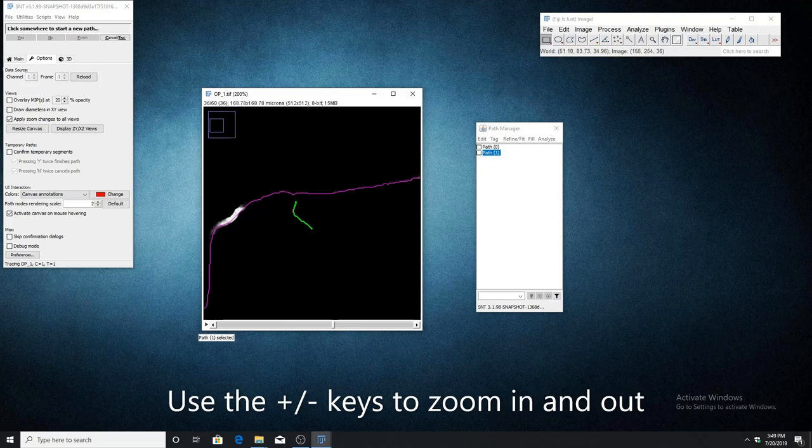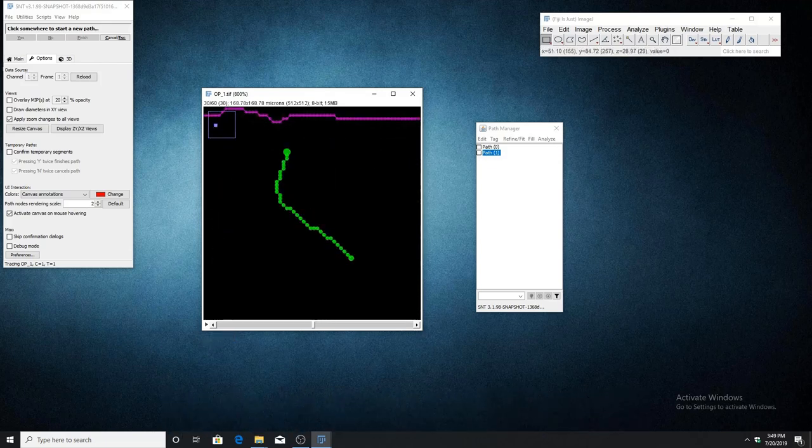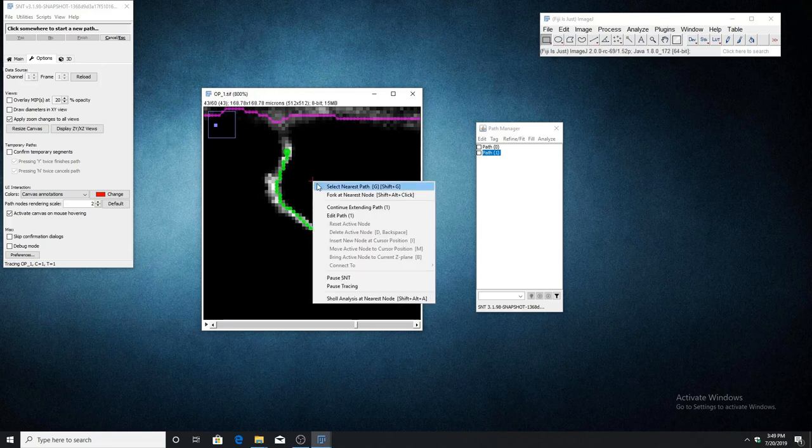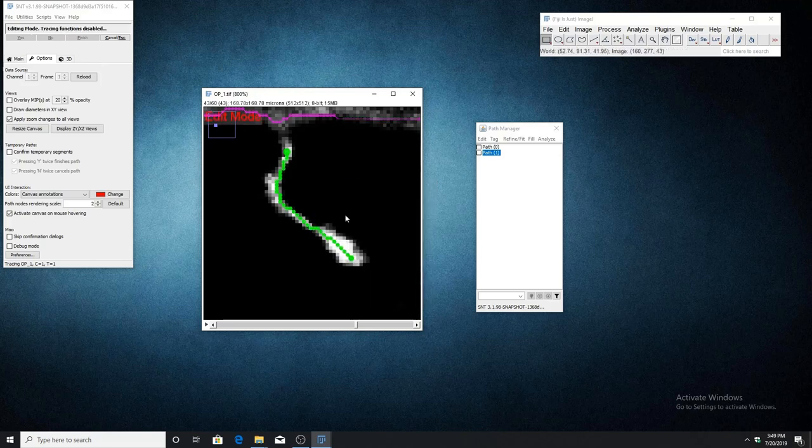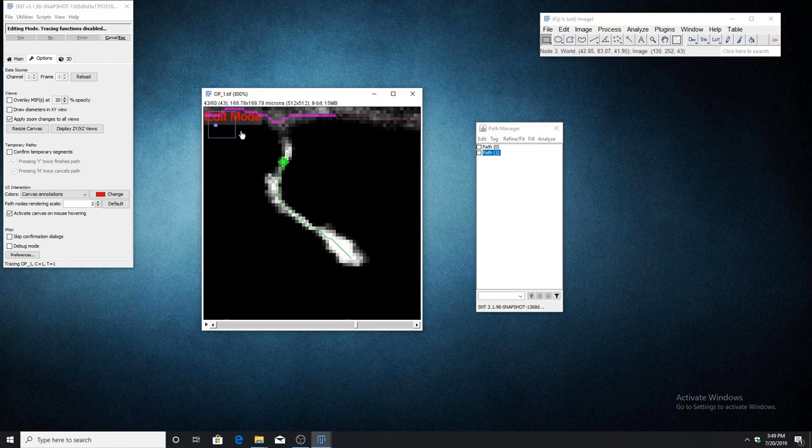I'm going to zoom in on it so we can see it more clearly. Once this path is selected, open the right-click menu and choose edit path. You'll see that we have now entered edit mode, which is indicated by this canvas annotation.